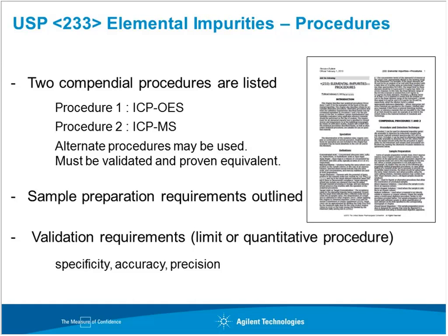And of course, Tim's going to be going over this in detail very shortly. The validation requirements are also outlined in this chapter. So there's all kinds of details on specificity requirements, accuracy requirements, precision requirements, what it takes to actually validate the method.